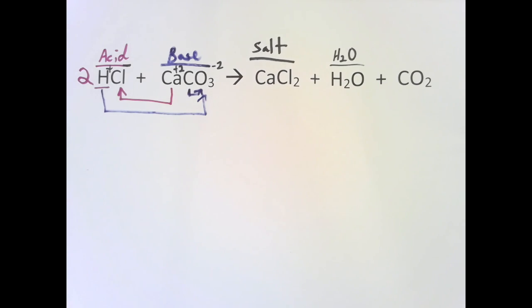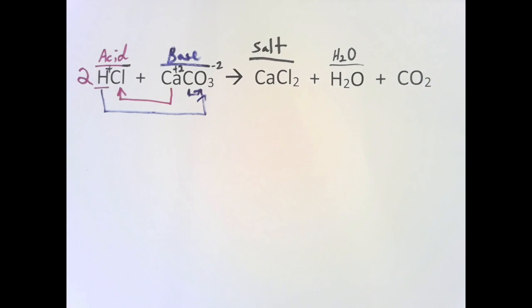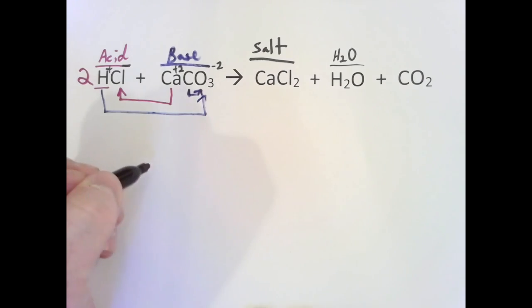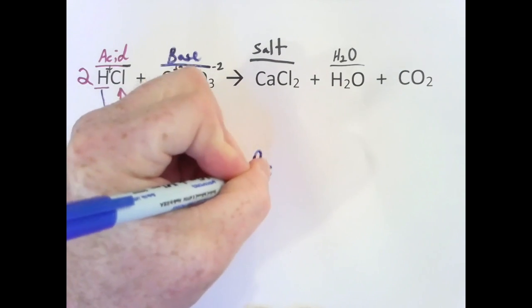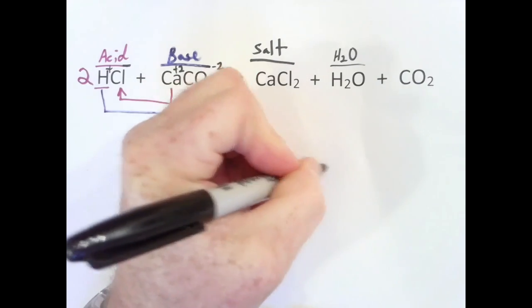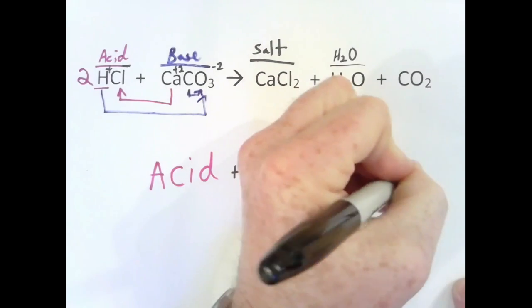That's the most common you're familiar with, but there's lots of different salts. This happens to be a salt as well. Now, of course, we've got a gas expelling here, but all of this combined gives us a basis for understanding an acid-base reaction. Anytime you have an acid and you add a base, it will always yield a salt plus water.